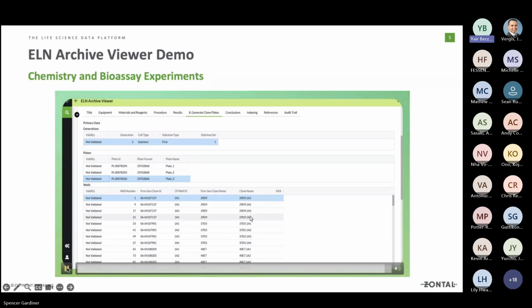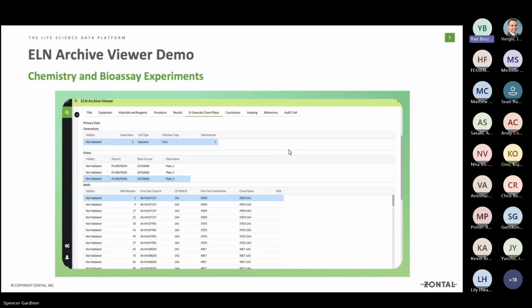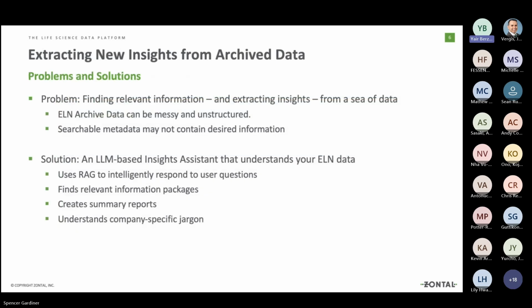So that right there is our ELN archive viewer. Now, ELNs are cool and all, but I'm sure the question that's on everyone's mind is, when are you going to start talking about generative AI? Well, we're here.